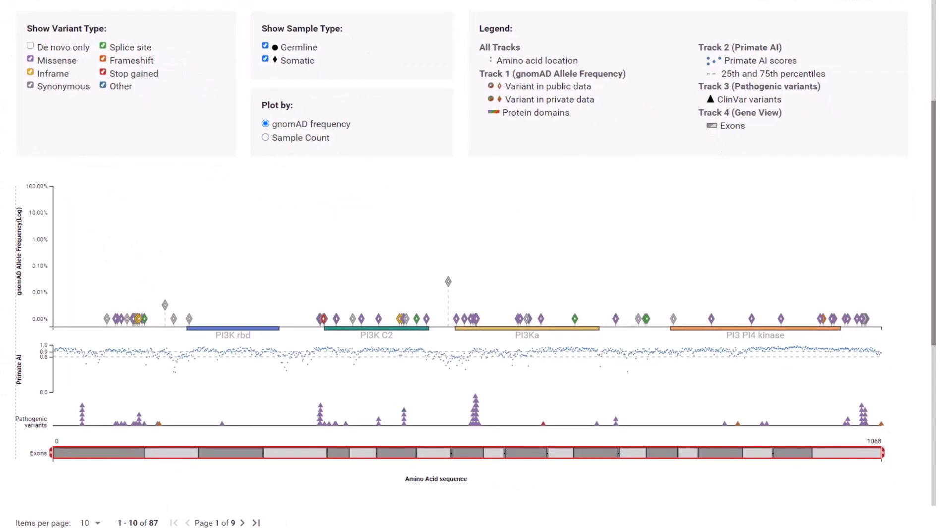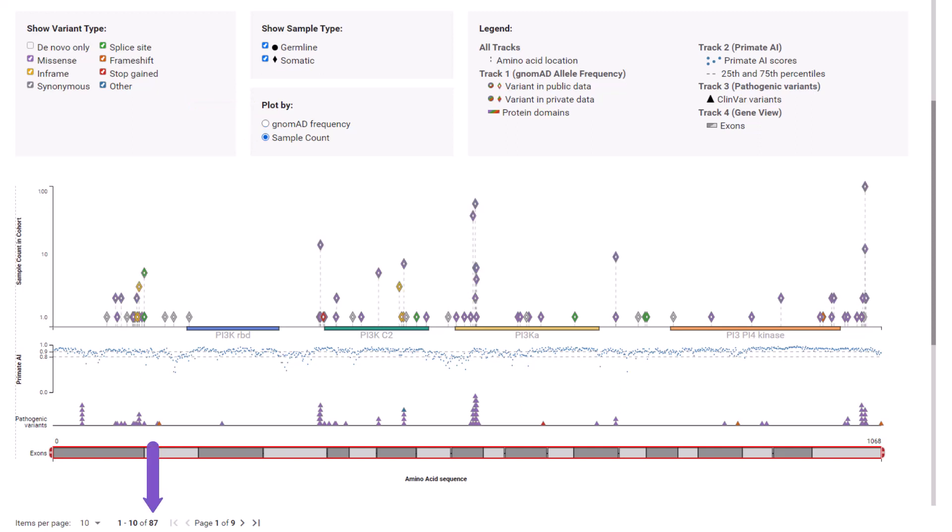The Needle Plot allows toggling the plot by Genome AD allele frequency and sample count. Select Sample Count. There are 87 mutations distributed across the 1068 amino acid PIK3CA sequence.